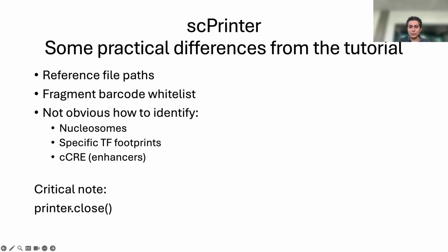One closing note here before I go through a couple of examples: this is an AnnData that uses backed AnnData, so make sure to close it. Otherwise, you'll be really sad when you try and access it later and it says it's corrupted and you have to rebuild it.